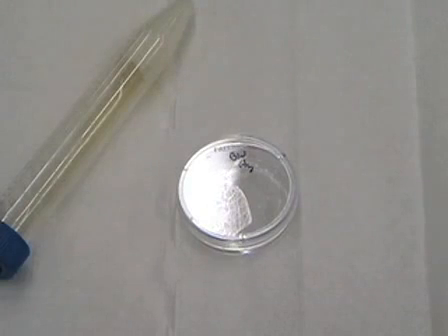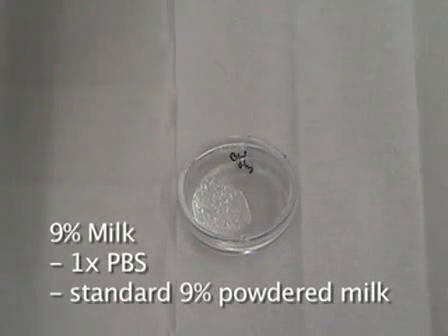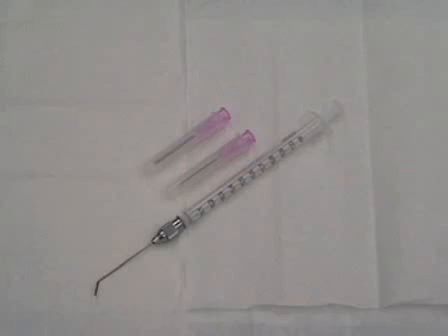9% milk is used to shuttle the sperm into the female. It is made up of 1x PBS and powdered milk found from your local grocery store. This is put into a small petri dish in an isolated fashion so that the sperm is in a localized area. 18-gauge needles are used to slice the epididymis open so that the sperm can swim out in the 9% milk solution of the petri dish.